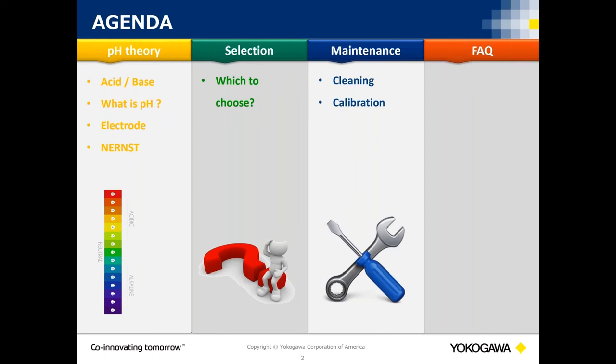So we're going to go over some best practices of what we have found over the years from being in the field and troubleshooting with customers, as well as hearing back from you guys what works. And I'm going to go over some calibration procedures. And then that's going to lead us into our question and answer section. In here, I do have a few of the most common ones, but at that point, obviously, we'll open it up to you guys as well for those questions that you have live.